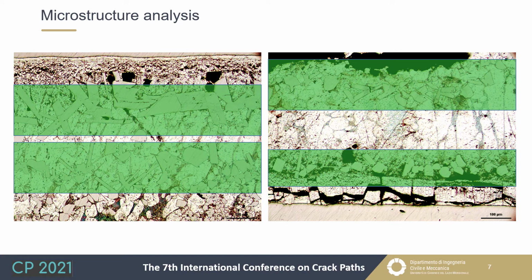The coatings characterized by a bath with 0% of titanium present a delta phase at the interface between the iron and the coating.